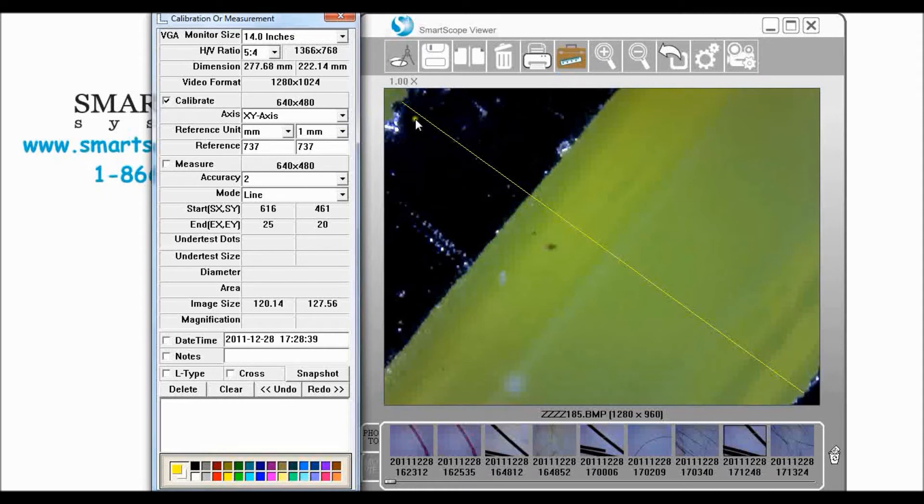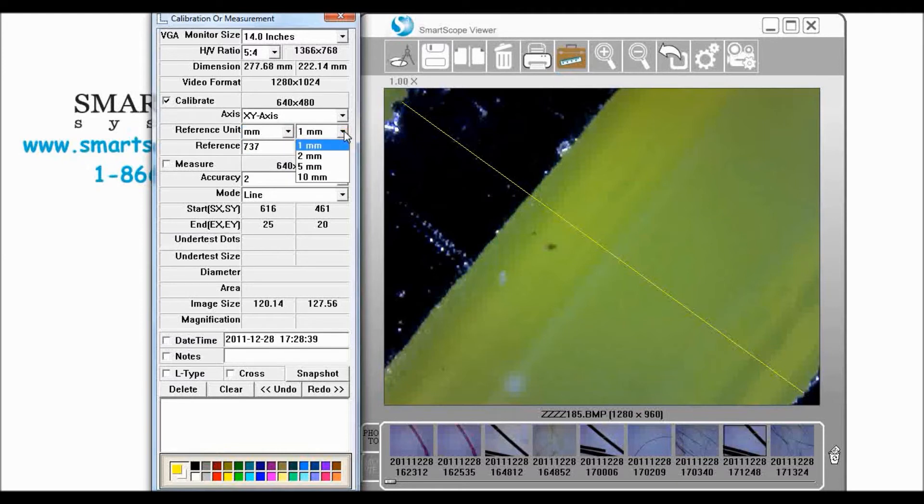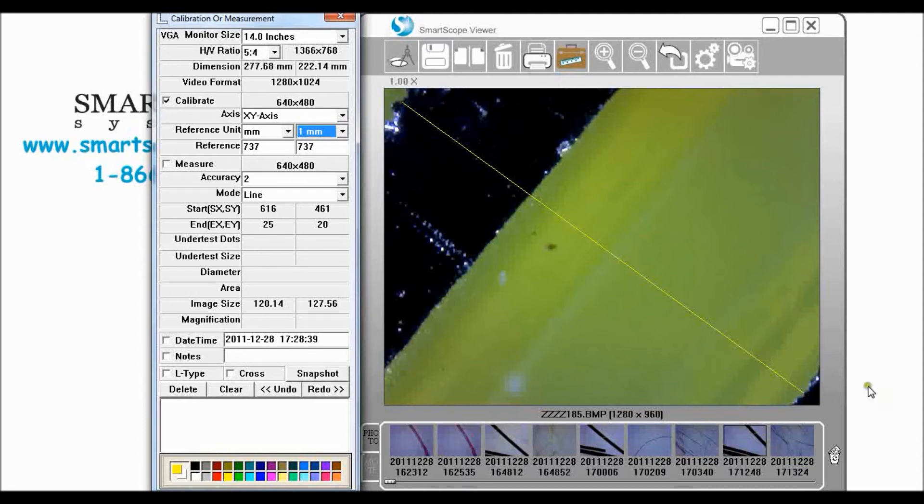You're telling it this is one millimeter. You can choose to do different units here. You can do millimeters or inches and you can calibrate to two millimeters or five millimeters. You can do different ones but what we're doing today we go ahead and set that and we told it this is one millimeter.